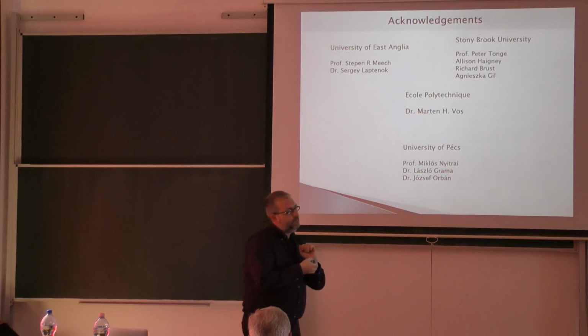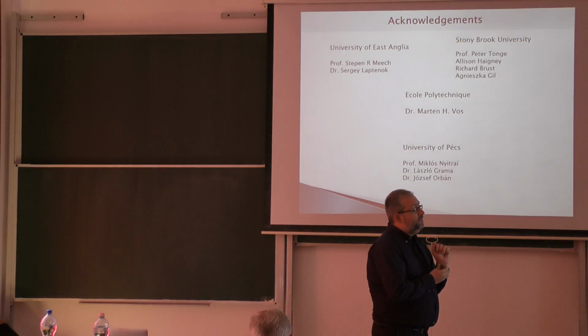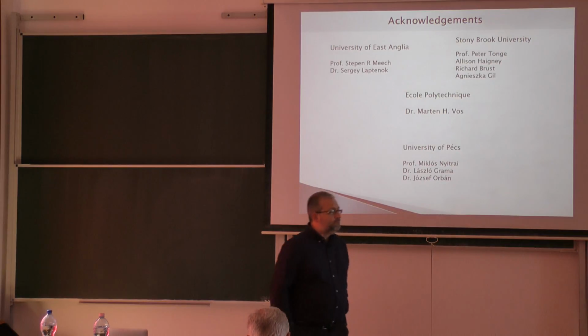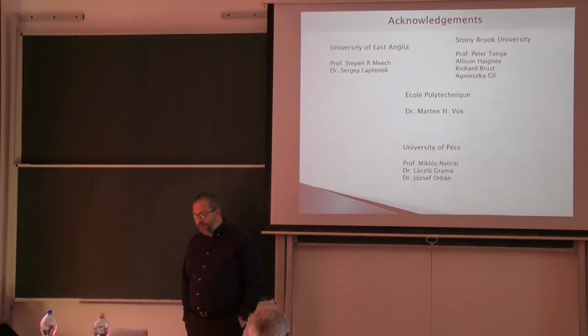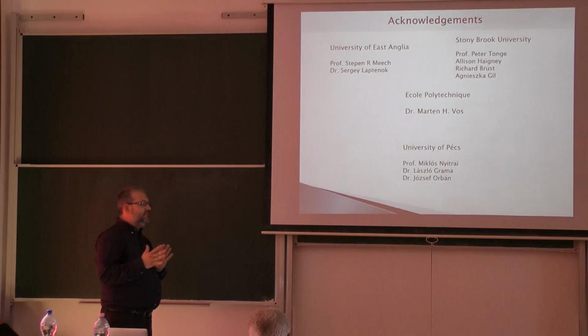So in terms of transient spectroscopy, what is fast in terms of tuning? What is fast? Because in OCT now there are two lasers, so very fast, megahertz. So in transient spectroscopy, what is the technology nowadays? Kilohertz, 10 kilohertz? Actually, we don't need megahertz usually.